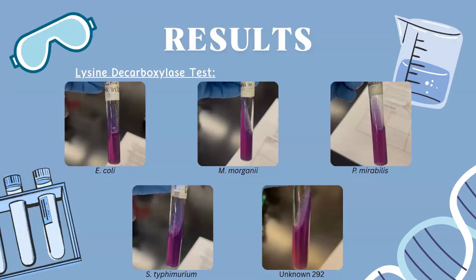But what we should have seen for the E. coli was a purple butt, which we do, because it's a positive for lysine decarboxylase, and it'll decarboxylate lysine, and it confirms the coliform identity. For morgani, it's a negative, and it should have been yellow. P. mirabilis should have been also yellow, meaning it's a negative because both of those do not decarboxylate lysine. For the S. typhimurium, it should have been purple also, which it is, and it has a strong lysine decarboxylation.